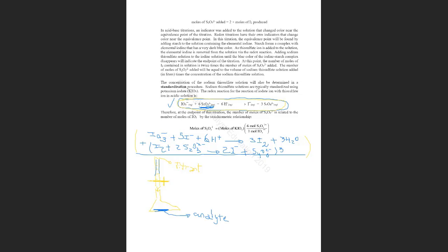First we wash the burette, so there is water inside the burette. And then we rinse it with our titrant to eliminate the water or other solutions that might dilute or contaminate our titrant. Because when we do a titration, we need to know the exact volume of the titrant when we reach the end point. So if the burette has water, it's going to give us error.